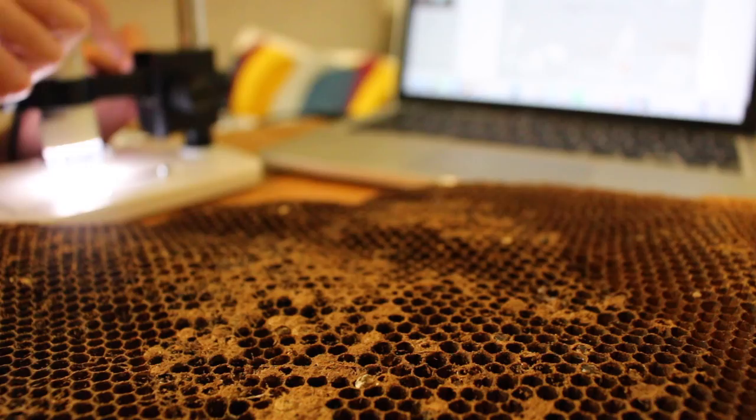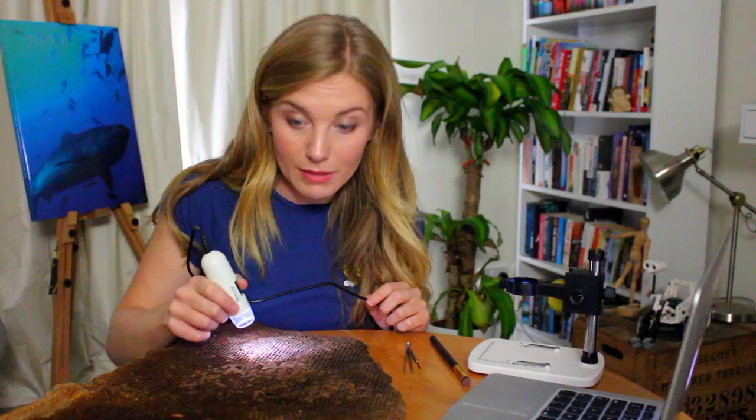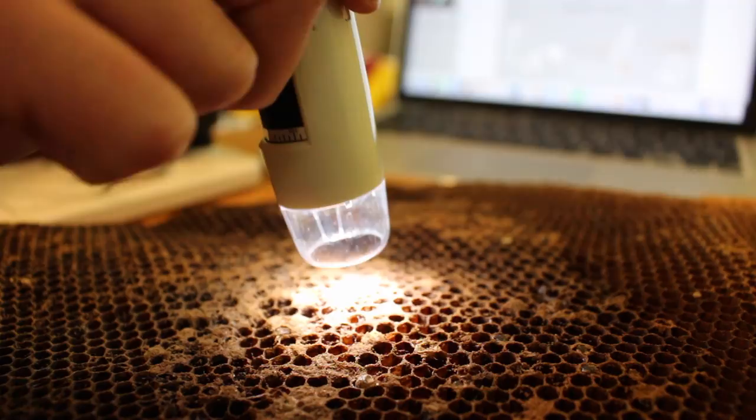Okay, all set up and ready to go — we've got our laptop, the special camera, our wax comb, and a couple of tools as well. What's great is my special camera is a handy little torch too, so let's see what we can find.